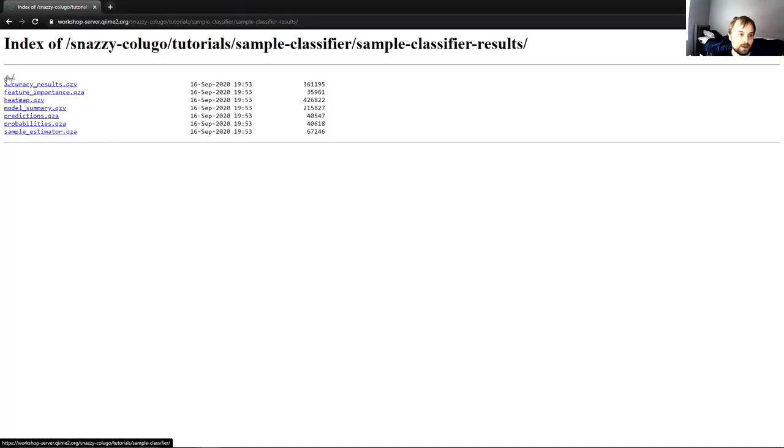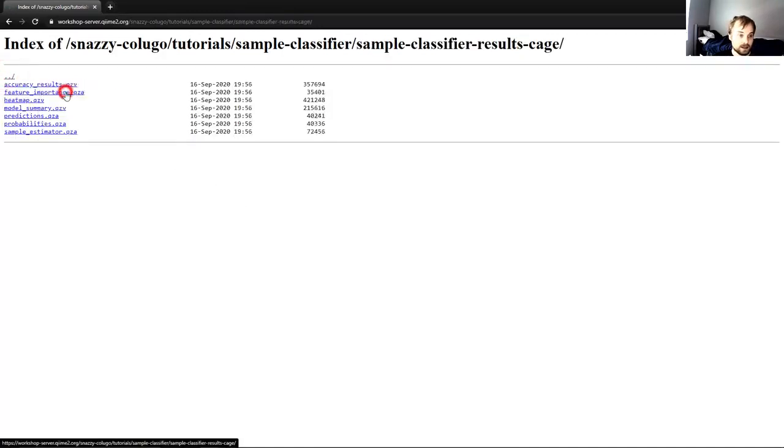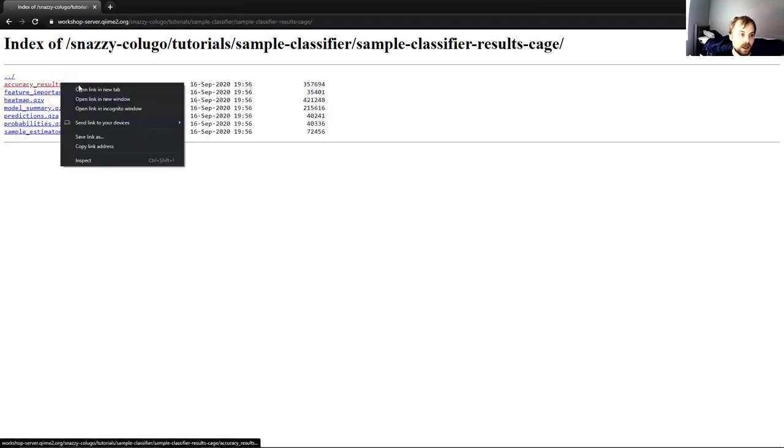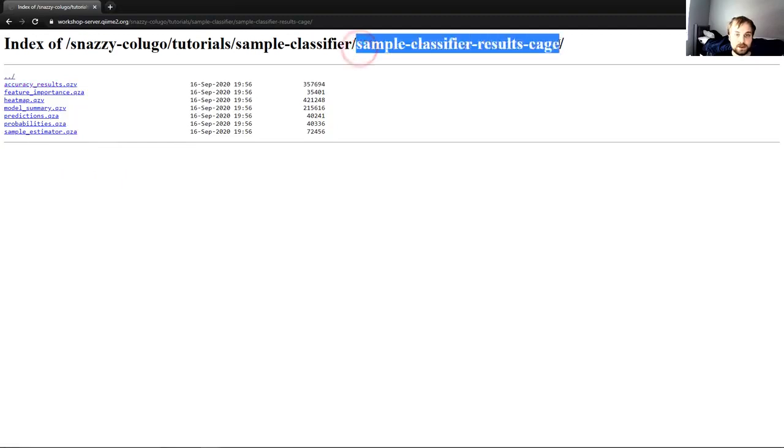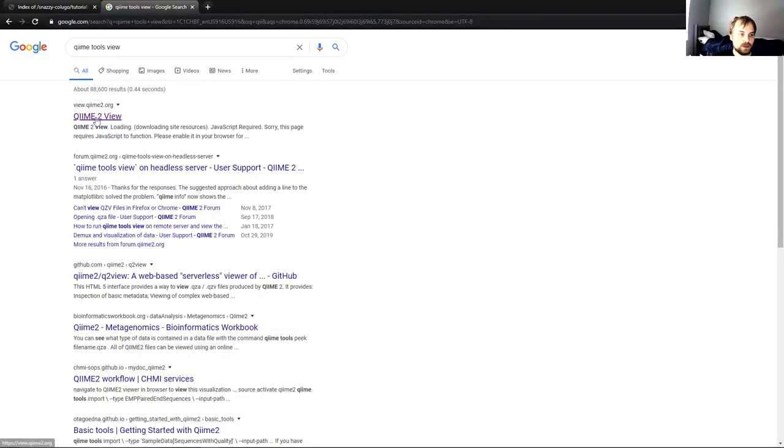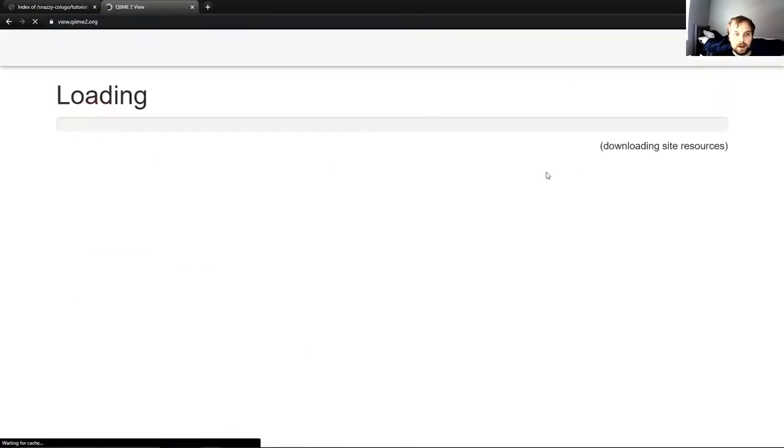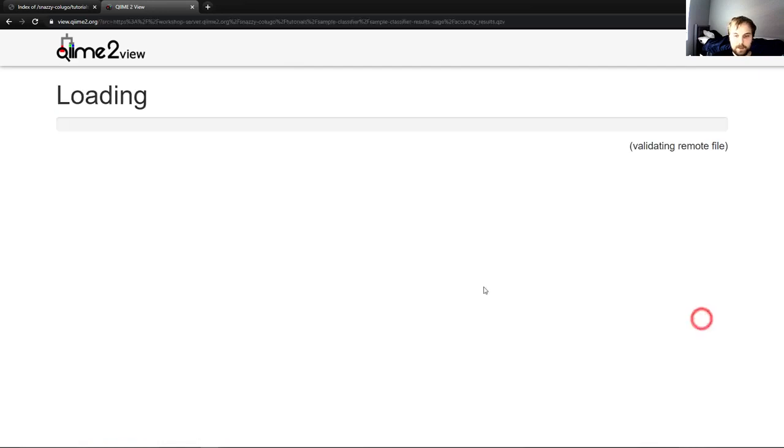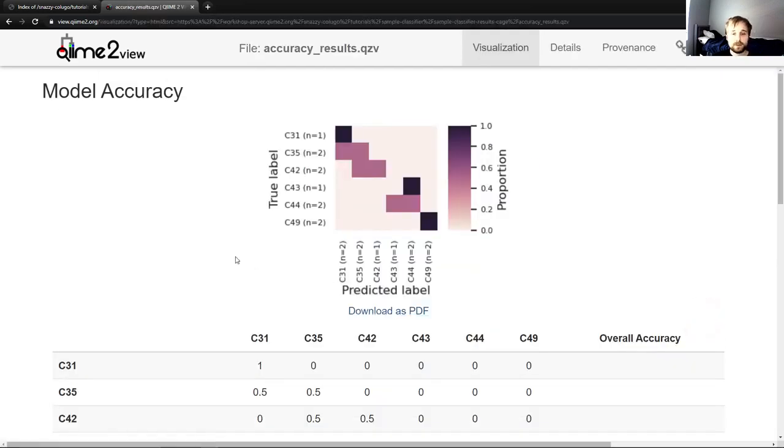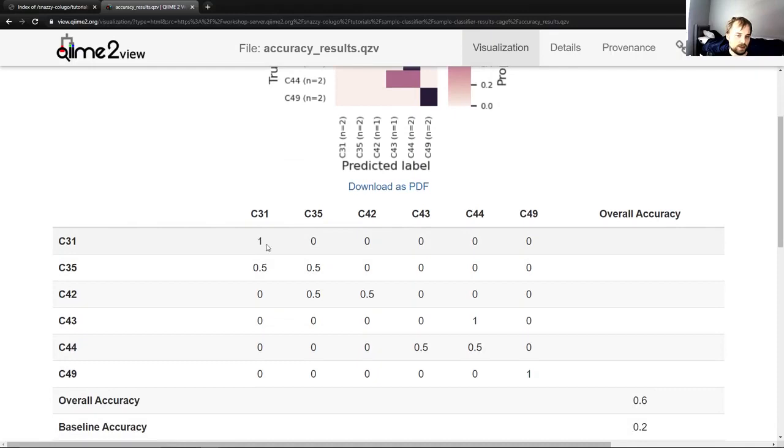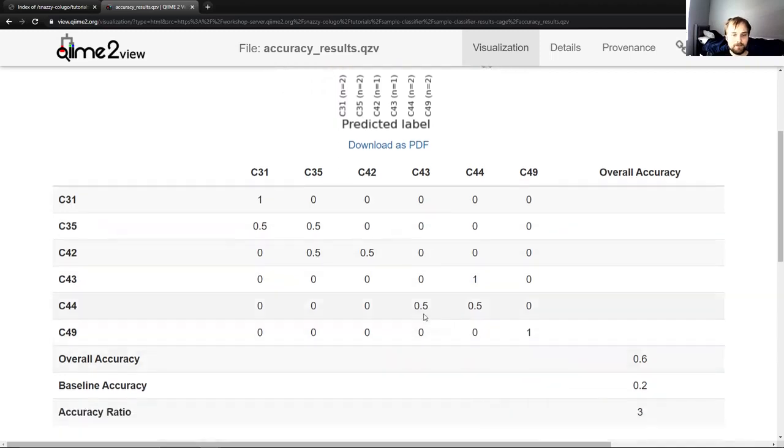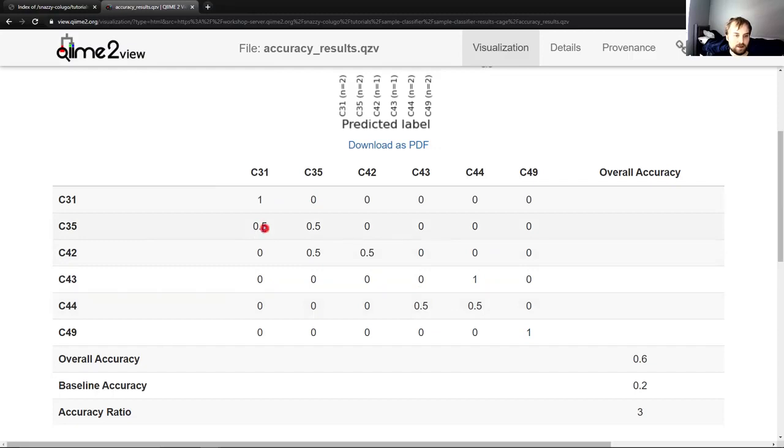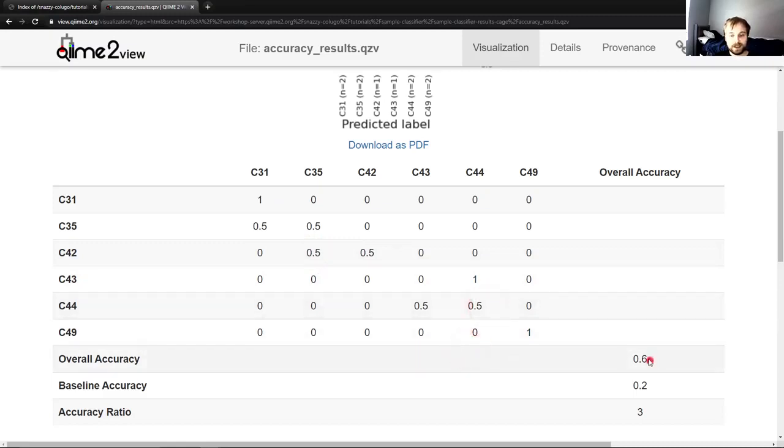So in order to view the accuracy results for this, I'm going to go here. I'm going to go back out of sample classifier results into sample classifier results cage. I'm going to copy the link address for the accuracy results QZV. I'm going to go to QIIME tools view and view a file from the web. And so you can see we have something that looks similar, but we did not do nearly as well this time. So we classified 100% of the mice that were from cage C31 as being from C31. Same for C44 and C49. So cage 31, 44 and 49 were fine. The others, not so much. So C35, we thought 50% were from 31. We got 50% correct. 42, same thing. We got 50% correct, 50% we said were 35 and so on and so forth.